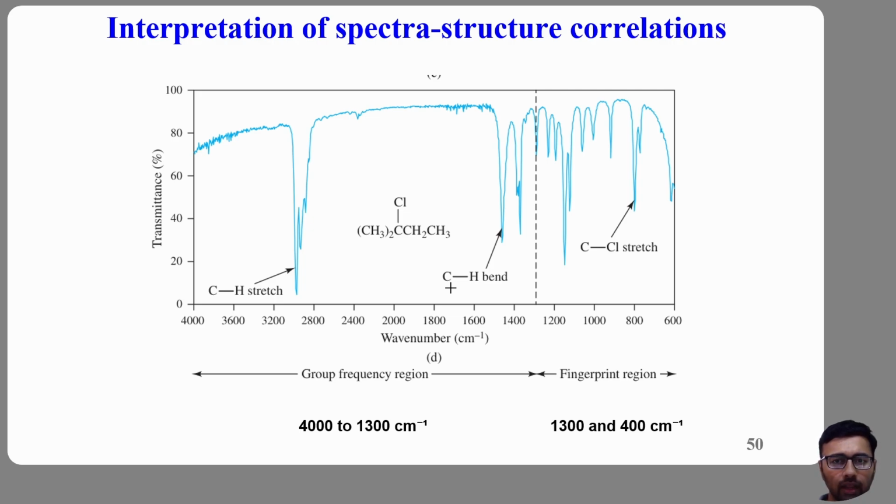In our next lecture, we will leave the world of infrared absorption entirely and enter another major branch of vibrational spectroscopy, that is Raman spectroscopy. There we will discover how molecular vibrations can scatter light instead of absorb it, and why Raman spectroscopy often reveals information that IR spectroscopy cannot.